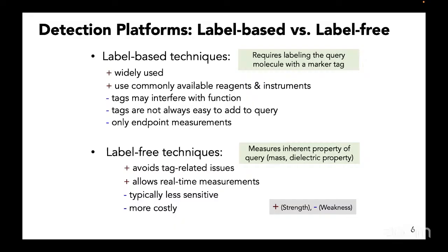Additionally, these technologies give you the readout in a very live manner, like you're looking at the biomolecular interaction happening, and you start measuring from the beginning of the experiment. If you see there is no interaction happening, then you try to make some changes and say, okay, can I increase the temperature? Can I increase the concentration? Can I try some other dilution? So many things you can change in live experiments. Therefore, you are looking at real-time measurements, optimization and troubleshooting. That gives you a lot more edge in using a label-free biosensor-based platform.